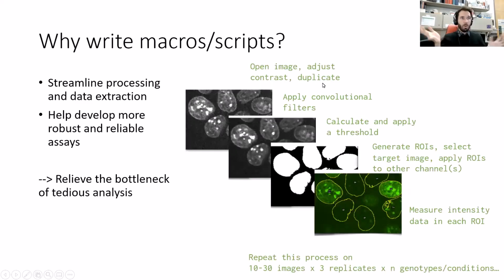And so why do we write scripts and macros and stuff like that? Well, the idea is to really streamline the processing and data extraction, and try to help develop more robust and reliable imaging assays. The whole thing behind that is that essentially we're trying to relieve the bottleneck of tedious analysis.